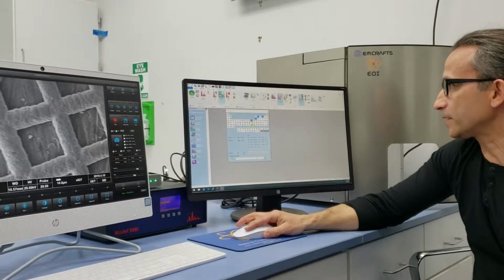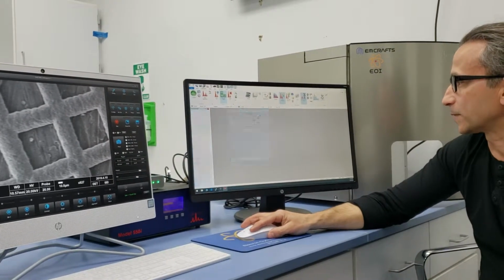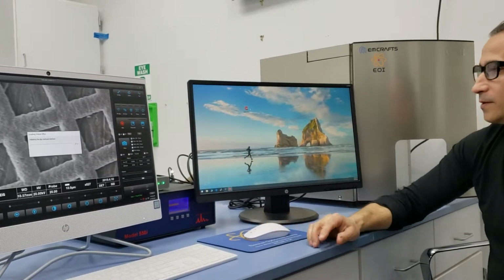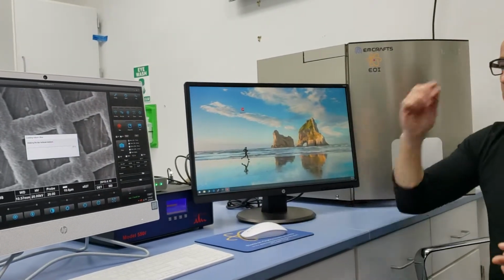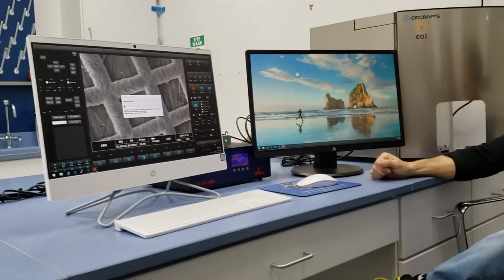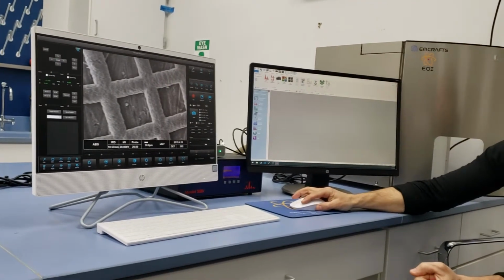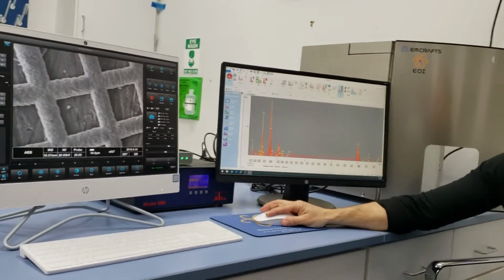So, let's start from scratch again. Okay, right? Sorry, sometimes I move too fast for my own good. Start from scratch again, right? This is okay. We're doing it. We're opening the software. It's okay. Right. Software's open. Work with spectra. Acquire spectra, right? Acquiring the spectra.